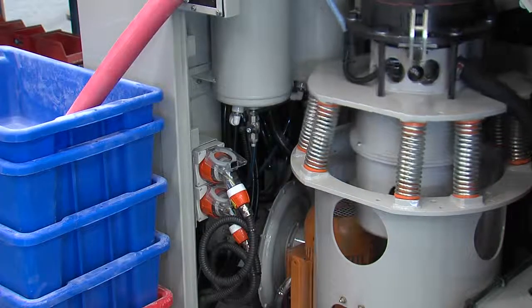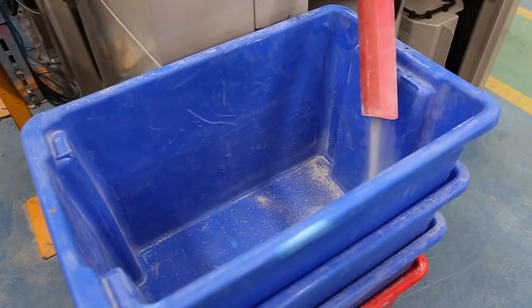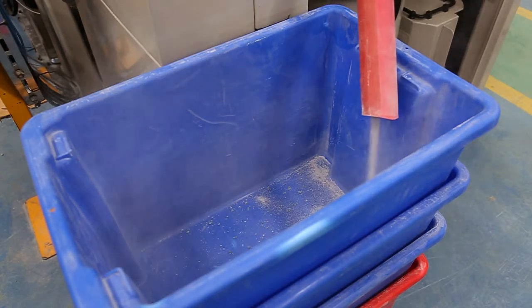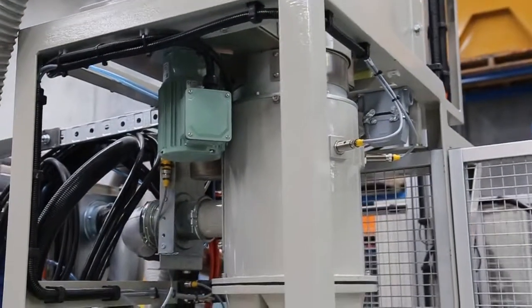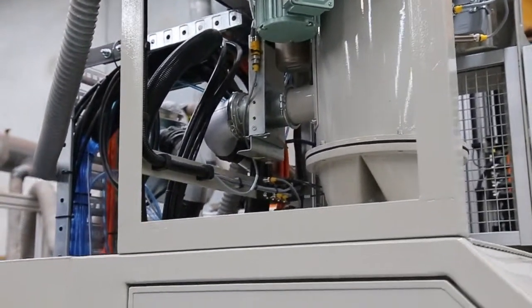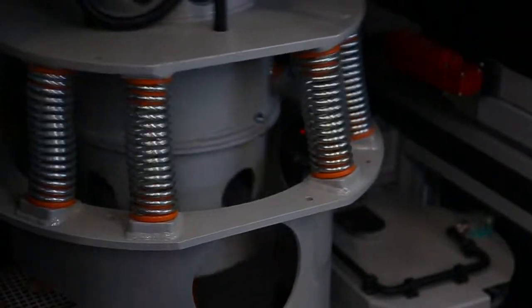Coarse material rejected from the sampler is discharged from the side of the cabinet. The coarse reject can be either collected or discarded via an optional reject conveyor. Both the tube sampler and autobatch mill incorporate inbuilt air blast clean and dust removal systems to minimise sample cross-contamination.